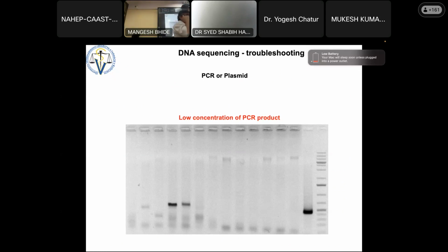Okay, agarose is one of the expensive parts in electrophoresis and everything. That's why several people say I don't want to make this. So the trick is that you cut this, and you cut this, you cut this. And if you don't have this kind of thing, you just take this part and put it in, for example, a big box, and put it in the freezer for life, maybe.